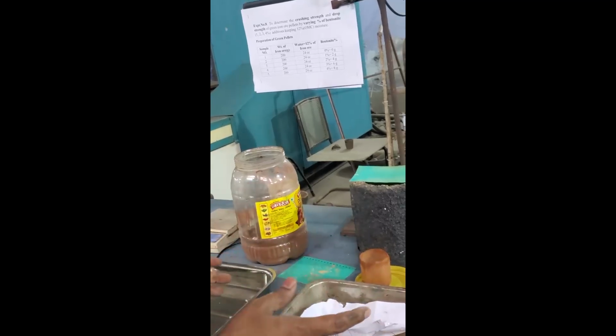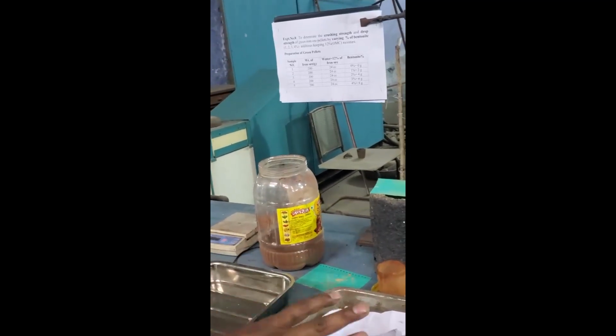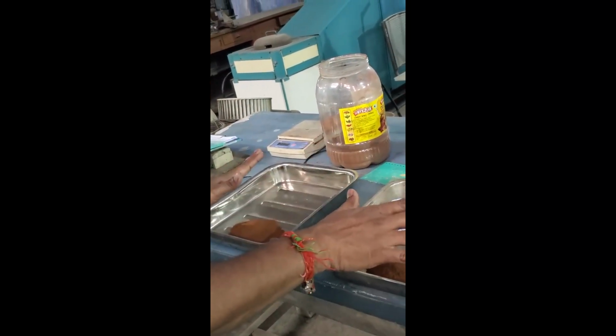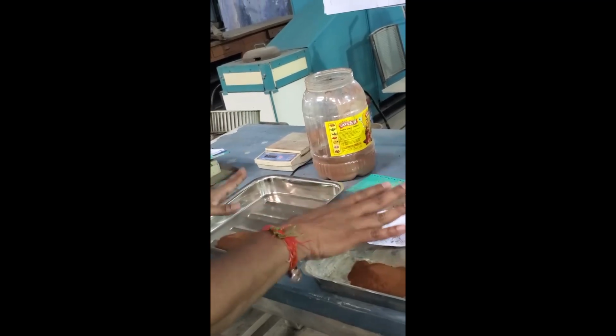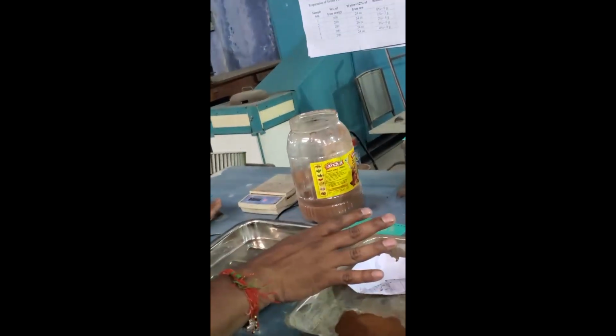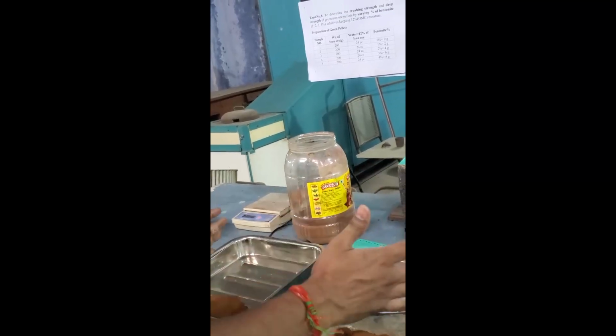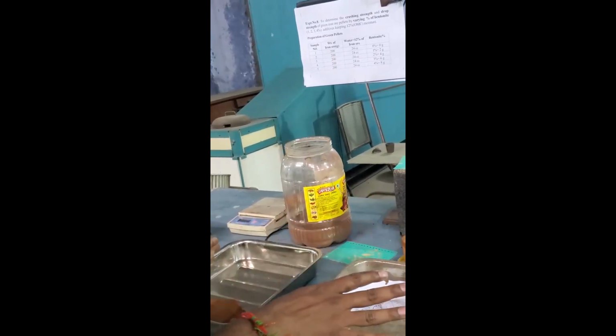So in this experiment, this is what we have seen. We have seen the raw materials, and we are going to make green pellets. In the green pellets, we are keeping the water constant. How much water are we taking? 12% of iron ore, constant. 12% of iron ore means we are adding 24 cc. What is the weight of the iron ore? 200 grams. What are we varying here? We are varying the bentonite percentage, from 0 to 4%.